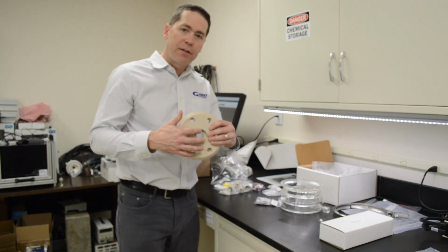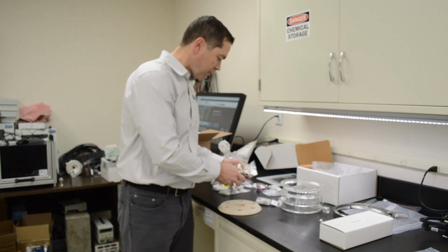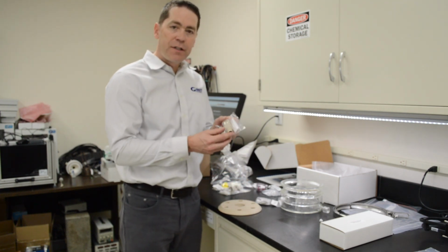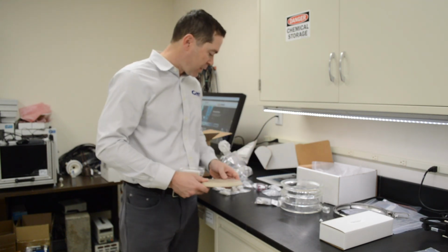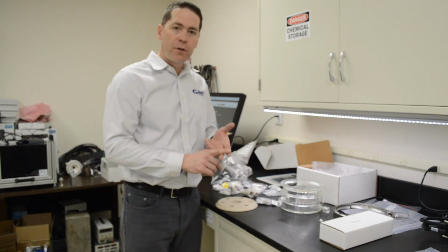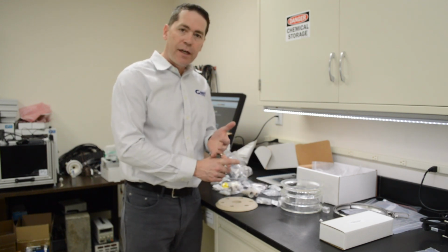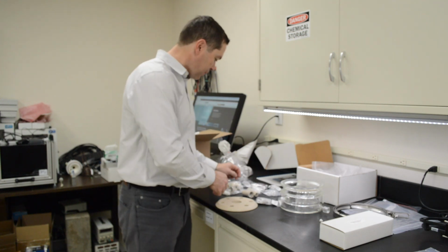And so that would get mounted. I'll show you a full assembly in just a few seconds. We have a series of adapters that go in these various ports. They get screwed in for reference electrode, for a bubbler, for a counter electrode. So all these ports, that's what we're using for.